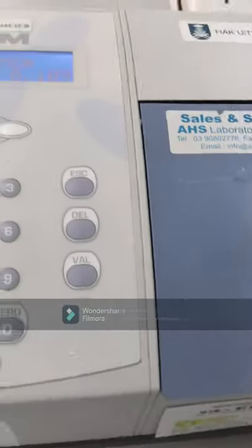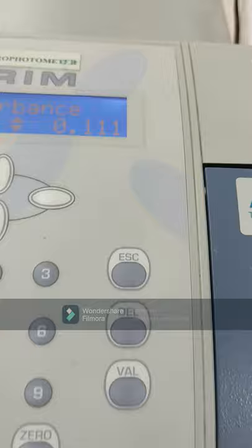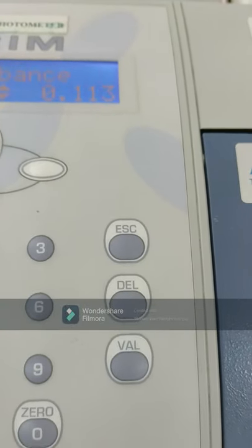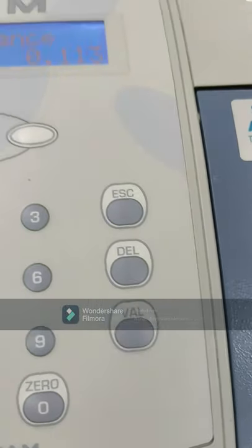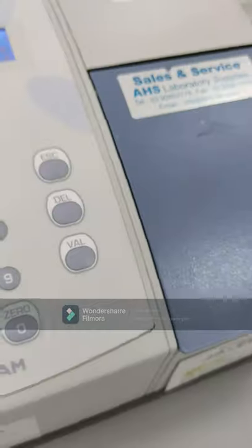You can see the different absorbance values at 0 minutes and 5 minutes. You need to calculate the enzyme activity by calculating the delta absorbance and then multiplying by the factor. Then determine what is the optimum temperature for the alkaline phosphatase.